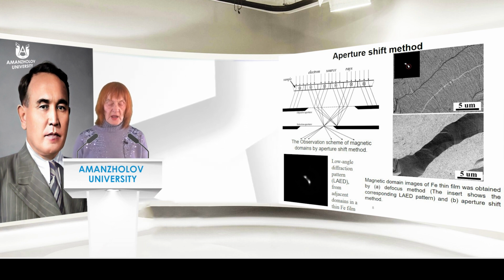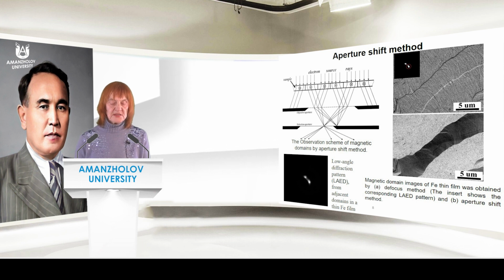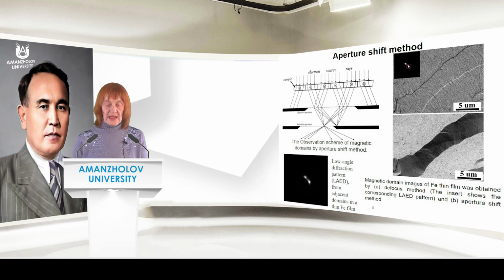The zero diffraction peak, corresponding to the unsplit reflex from a blank area, is superposed with the low-angle electron diffraction pattern of adjacent magnetic domains.